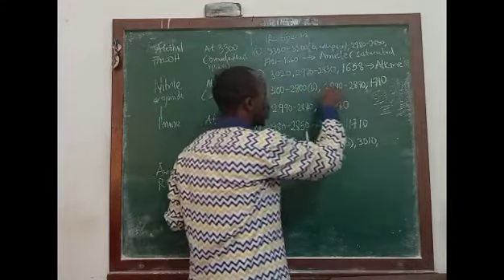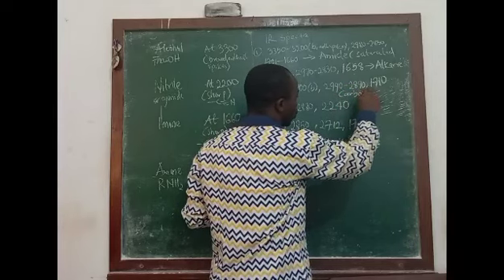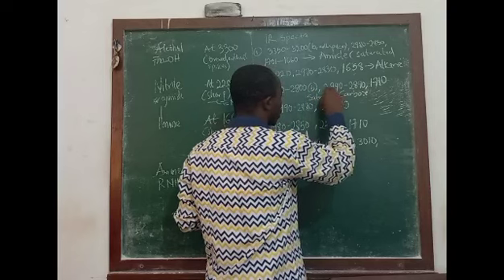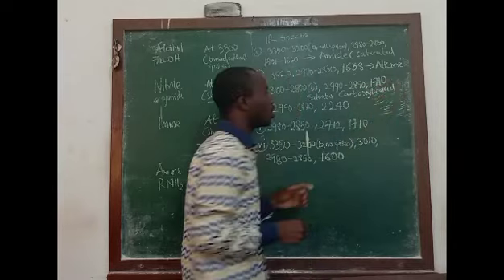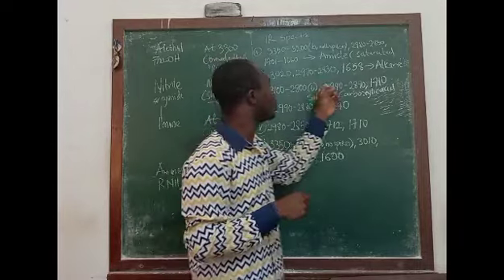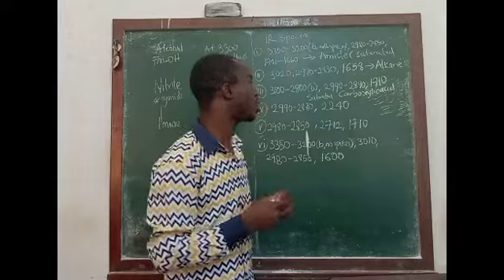That implies this compound is a carboxylic acid. It is a saturated carboxylic acid, not an unsaturated one, because we don't have any signal just above 3000.